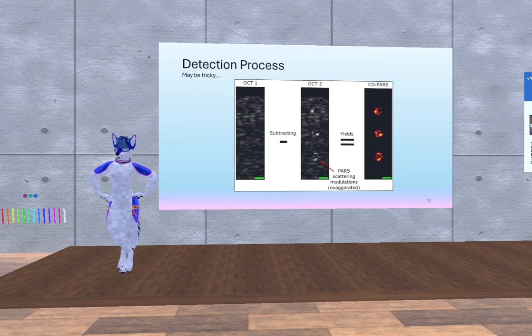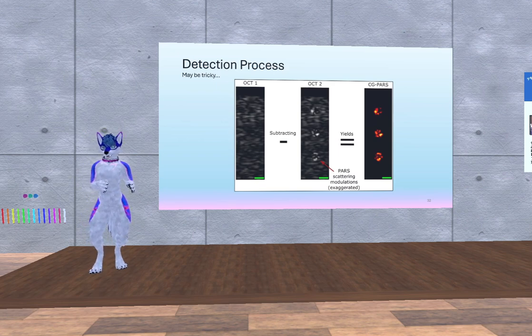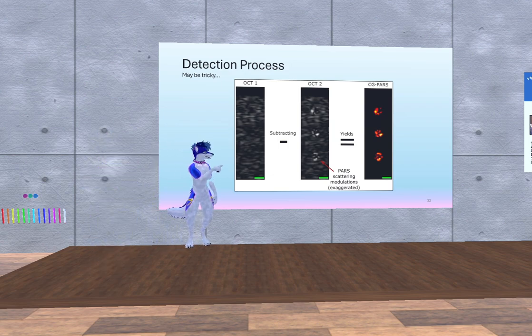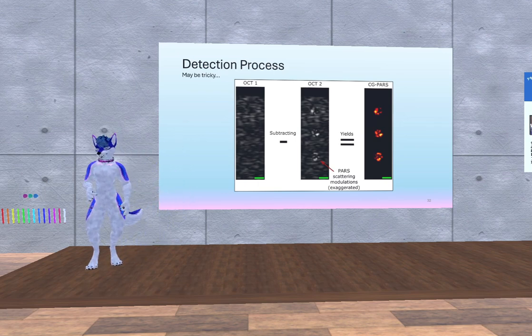That provides your scattering contrast. So refractive index generally traces its way back to susceptibility, like electric field susceptibility, right? Which is a broader concept, essentially how electric fields propagate through material. But the refractive index is probably better thought of as this optical impedance, right? That's what gives you this kind of information. If at the top here we have say air and then a surface, the reason that you see this surface is because there's a difference in the refractive index there. So there's a difference in impedance which causes reflection and transmission at that interface.